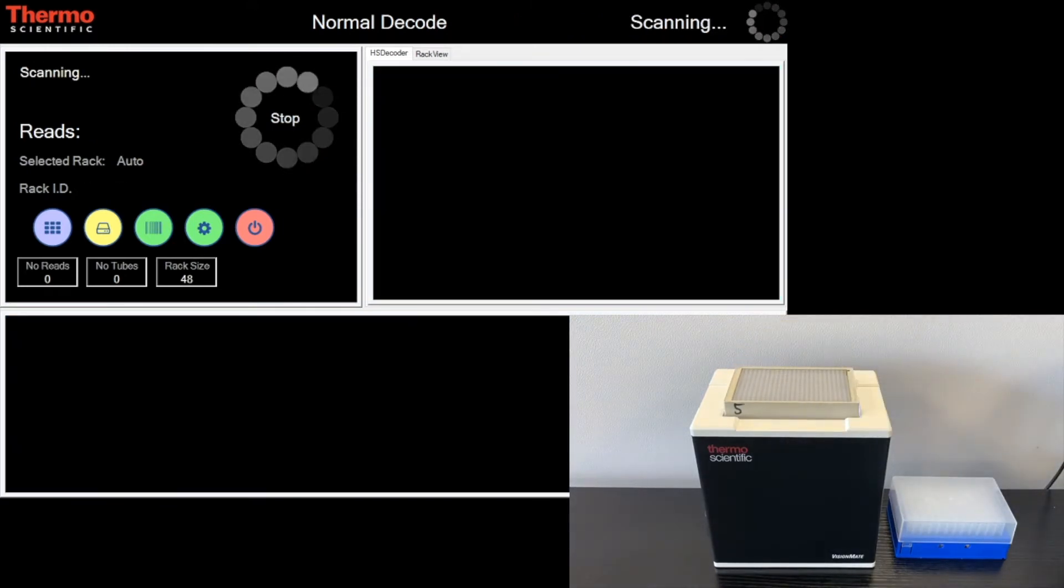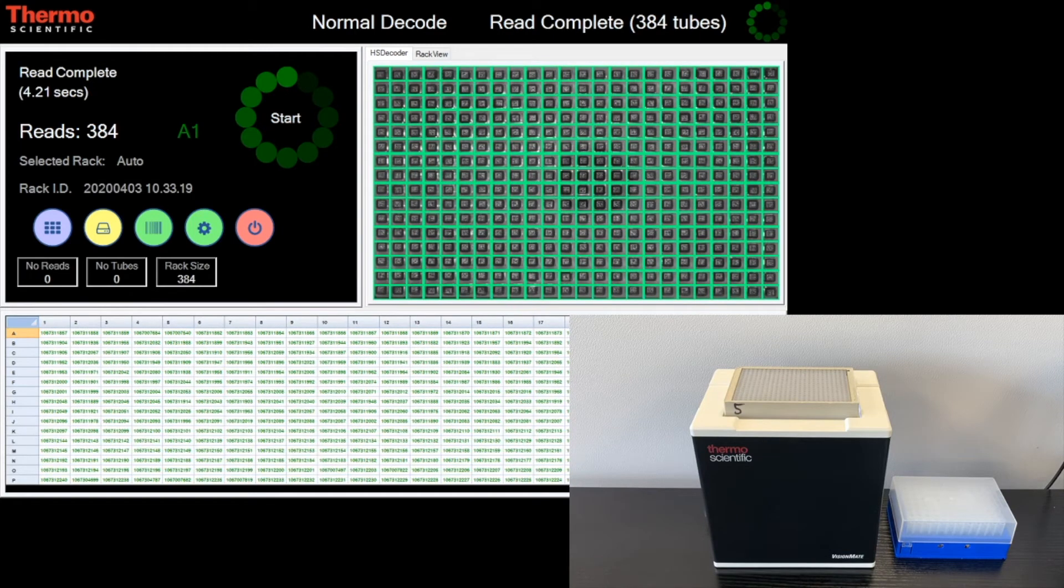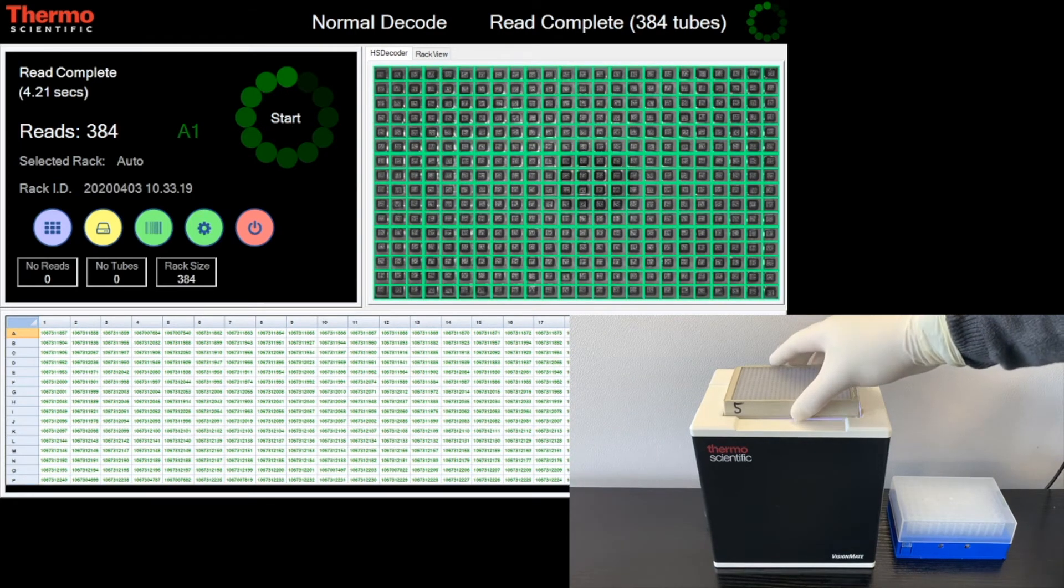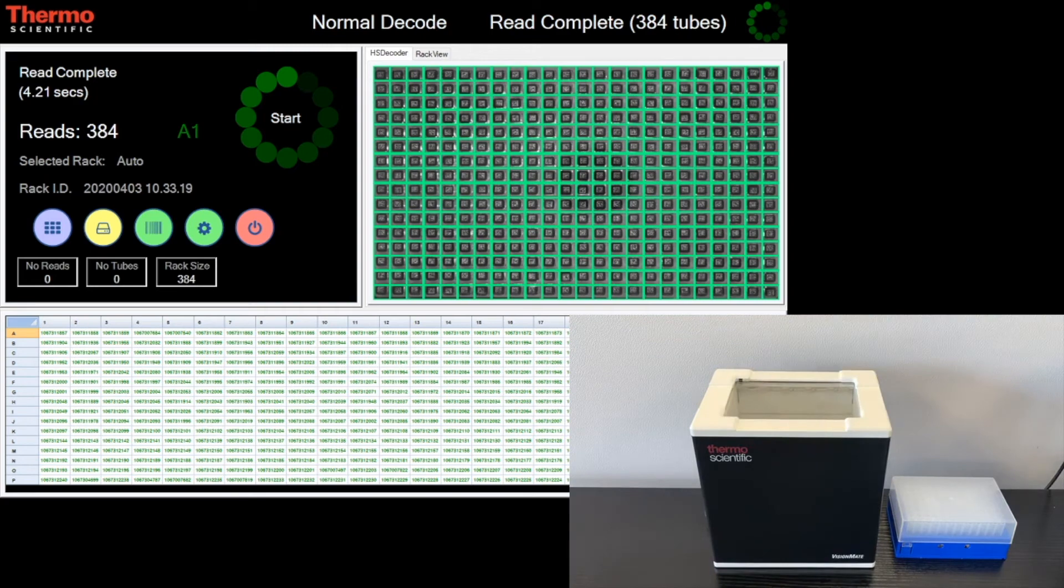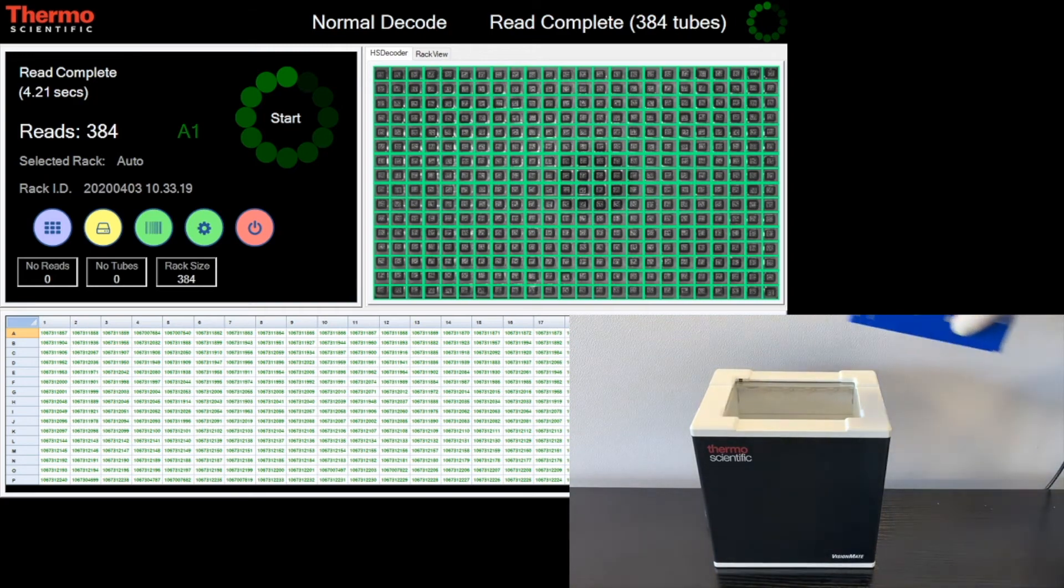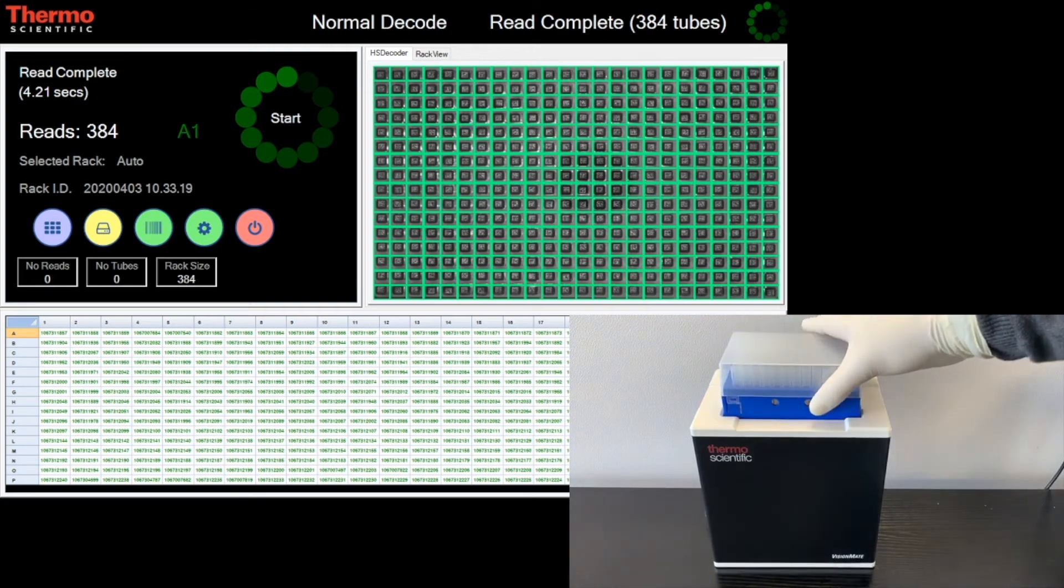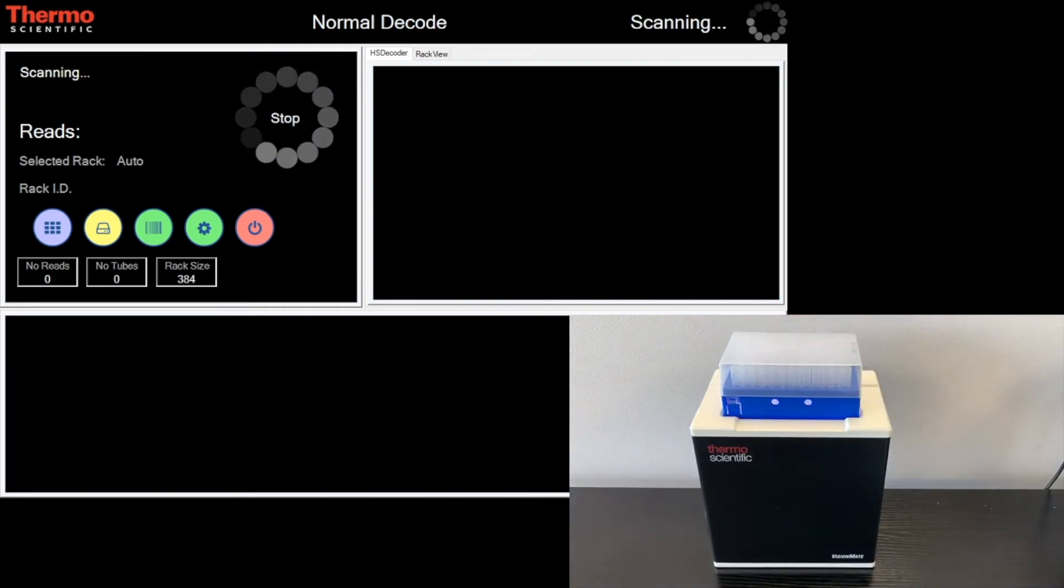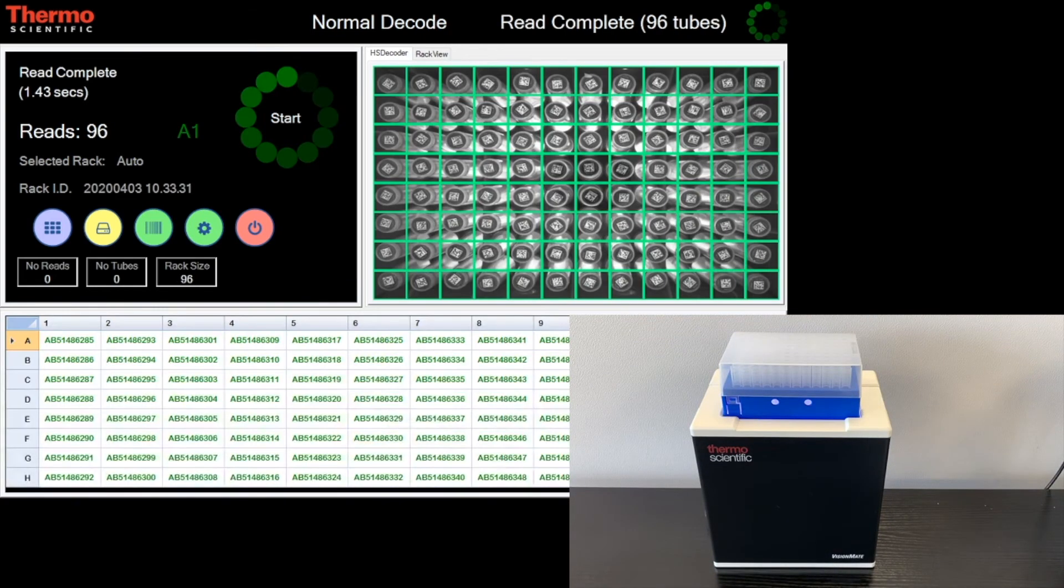Reading up to 384 samples in one process. Exporting of data is fast and reliable.